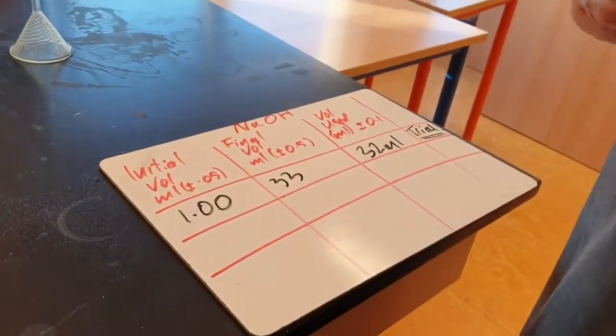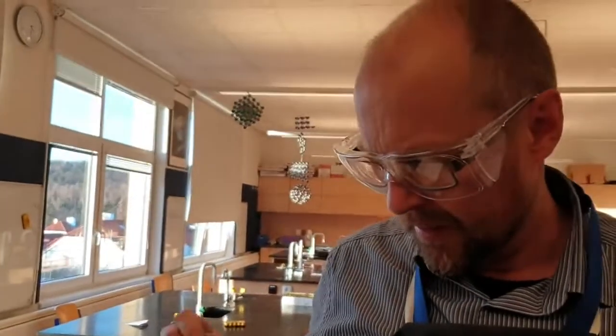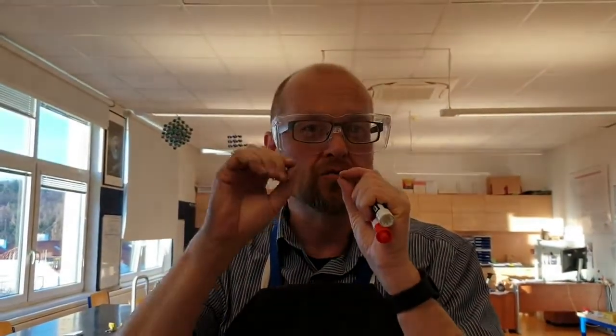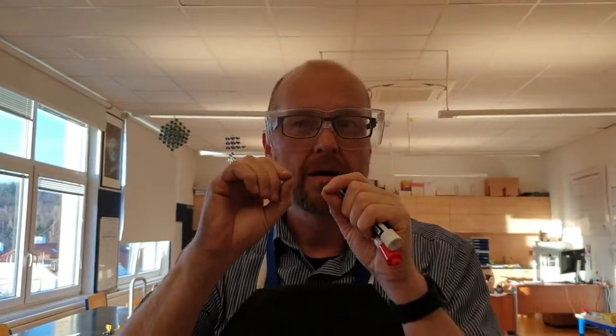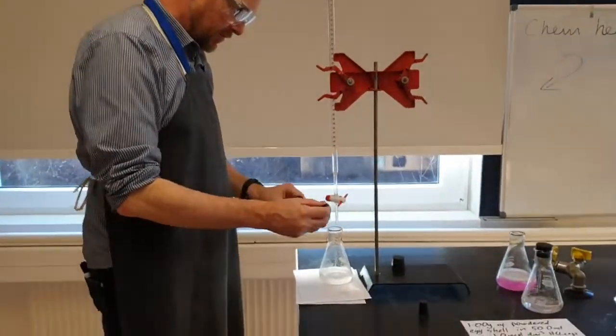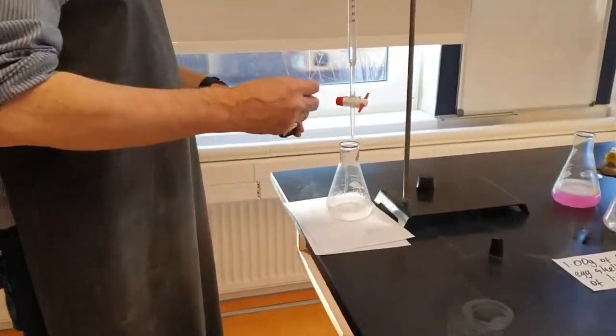Okay, so I'm going to repeat the experiment, but this time I'm going to stop just before I add 32. Maybe I add 30 and then slow down and go drop by drop. She put sound effects in there—I'll try again, that was cool. Again, not too many drops, not too few drops. Three seems about right.